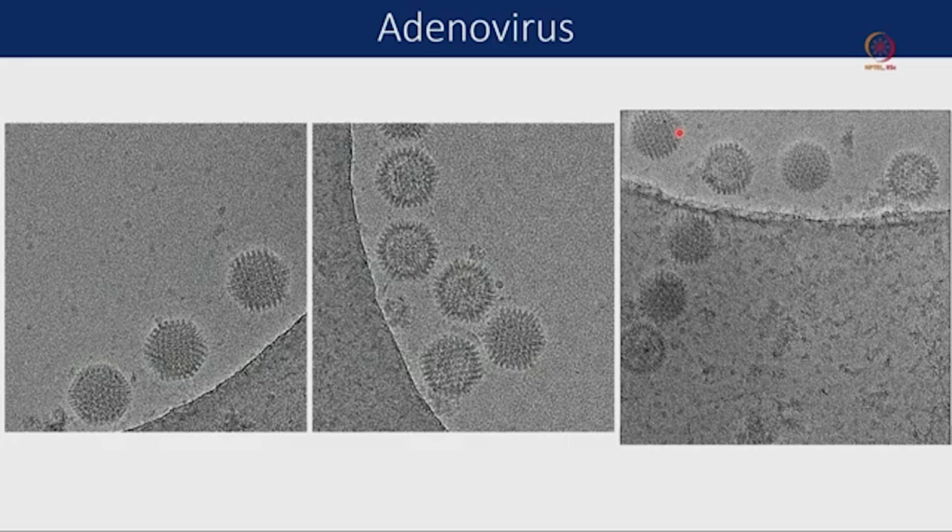Today we will finish here the entire microscope anatomy, starting from the electron gun to the detector, how we can collect good data, as well as how we can do the motion correction, why it is important, and how it is affecting our high resolution signal. Some of these parts we are going to repeat again when we start the data processing.